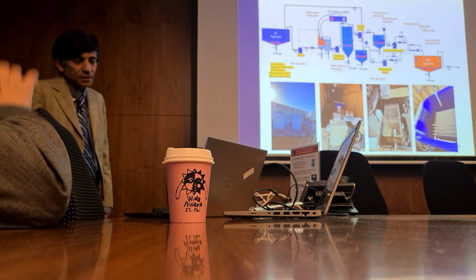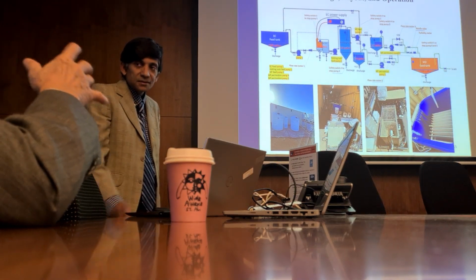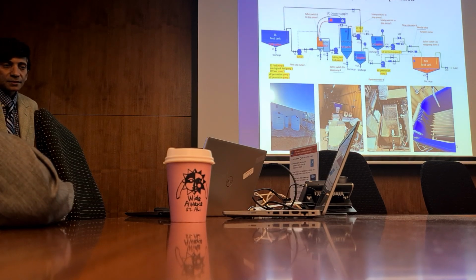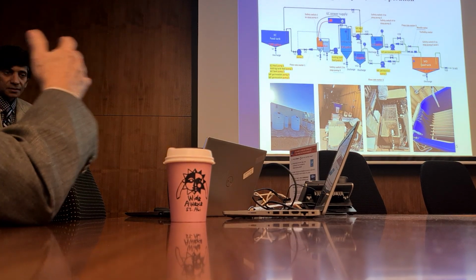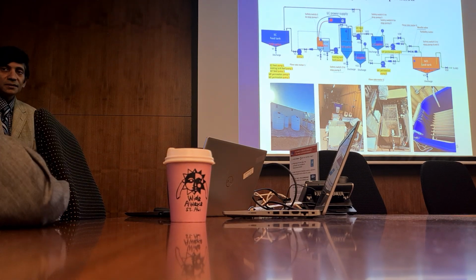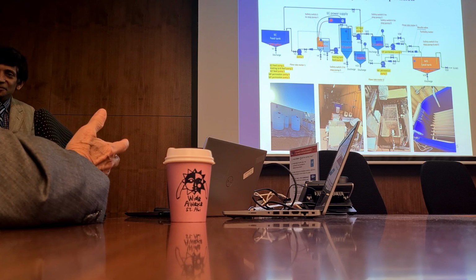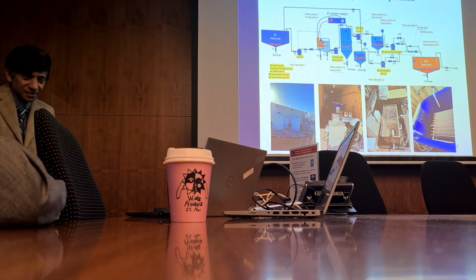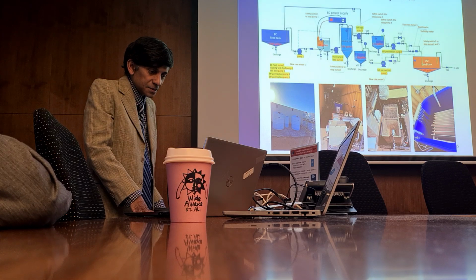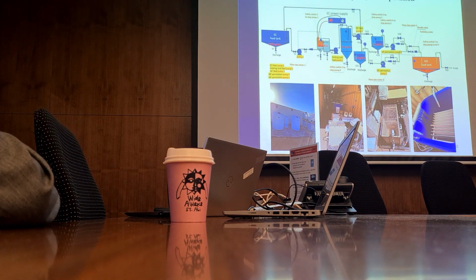Let me continue on the following issue, because I did see this can be a critical problem for your other bio applications, including virus filtration. It's very critical for biotech. So for that case, will a truly hydrophilic membrane help? Yes, a hydrophilic membrane will help, definitely. And an extremely hydrophilic one will also help.